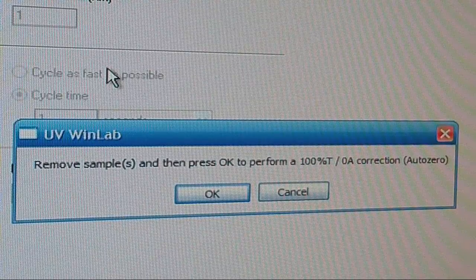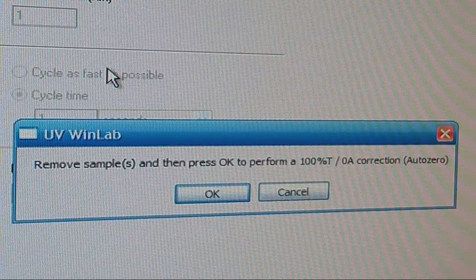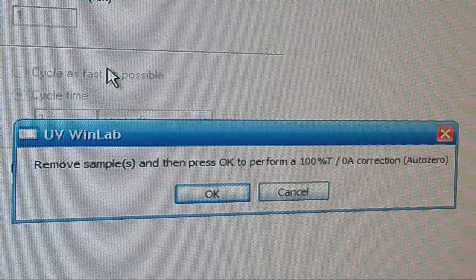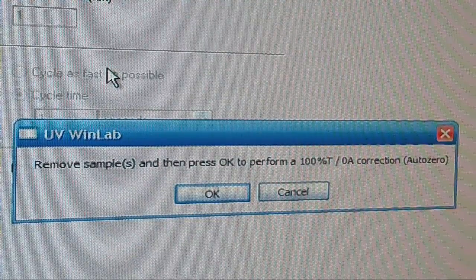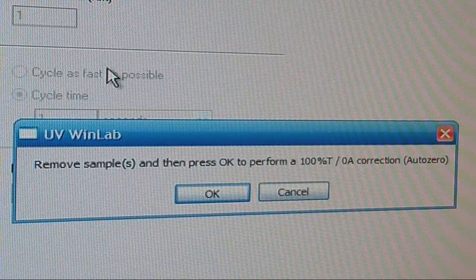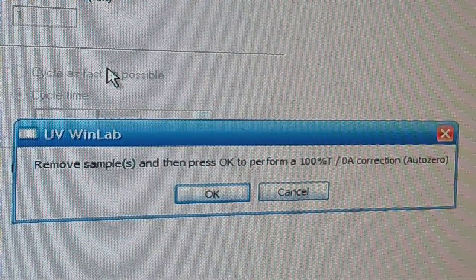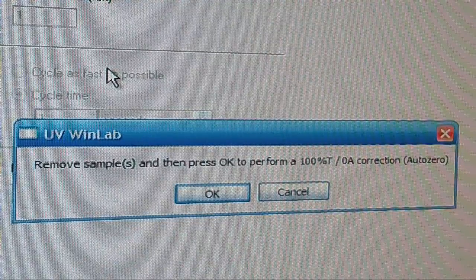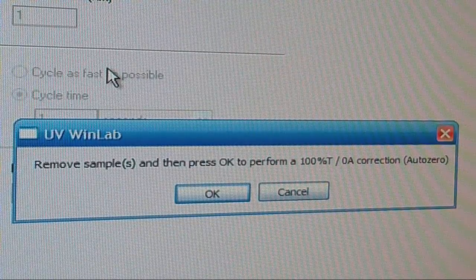We've always used this in a way that doesn't necessarily follow those directions. So that direction is the proper one if we're always going to use a matched reference cuvette. So you notice how we had two cuvette things in there. If you had one in the front, one in the back, and the back one was always just solid. Okay.